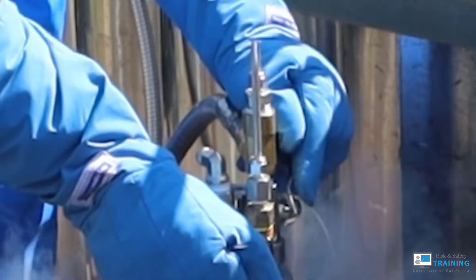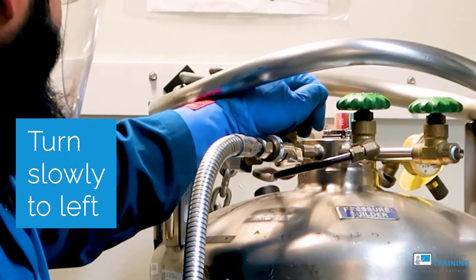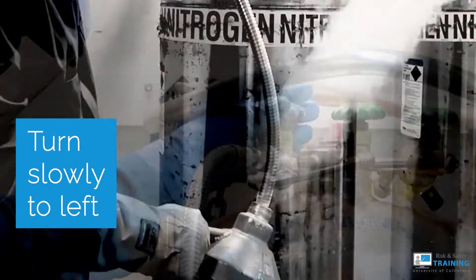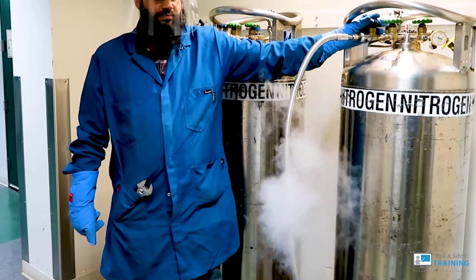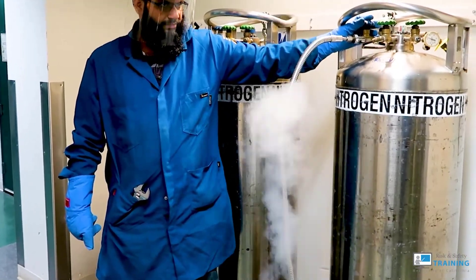Once you insert the transfer line, you're ready to open the valve. Turn slowly a quarter at a time. If you turn it all the way open, the pressure will be too great.